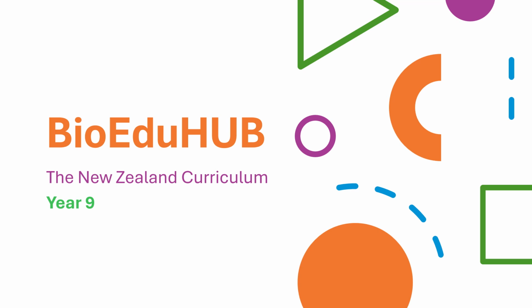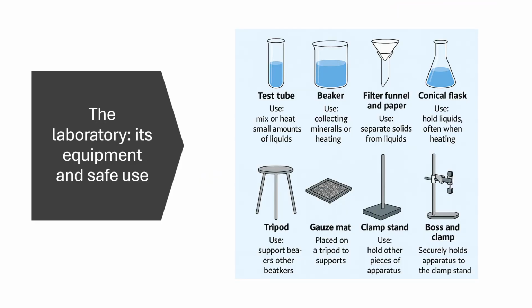So today we are focusing on the first lesson, the laboratory, its equipment and the safe use. I think you have seen the science laboratory. Normally the lab is designed to carry out experiments and undertake investigative inquiries. Within the science lab, there are lots of equipment available for you to use.